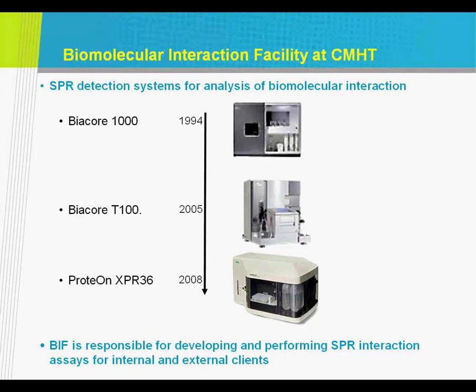We no longer use the Biacore 1000. We put that to pasture about 2 years ago. So at the moment, we've got these two instruments, the Biacore T100 and the ProteOn.